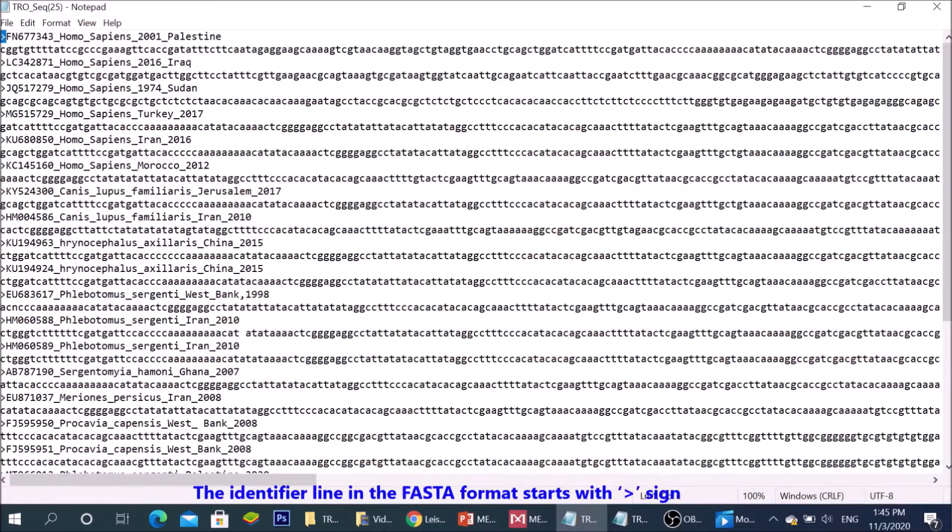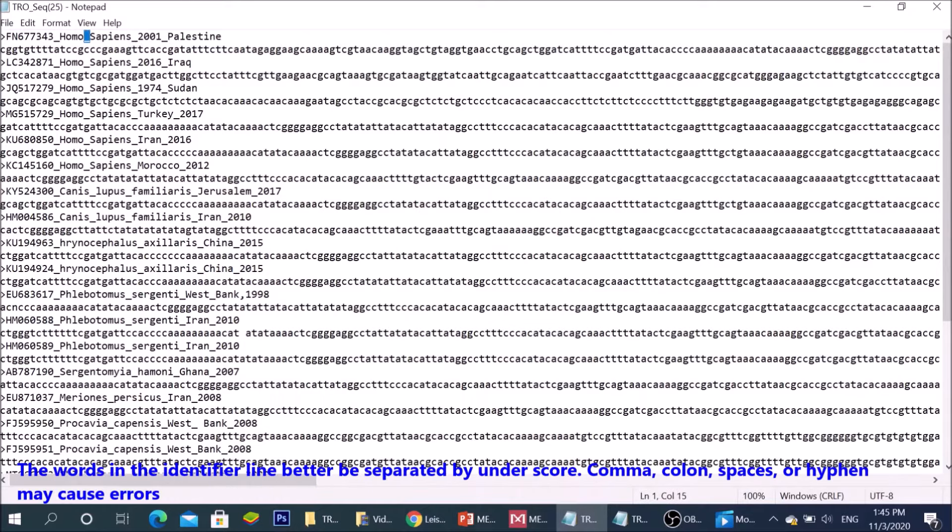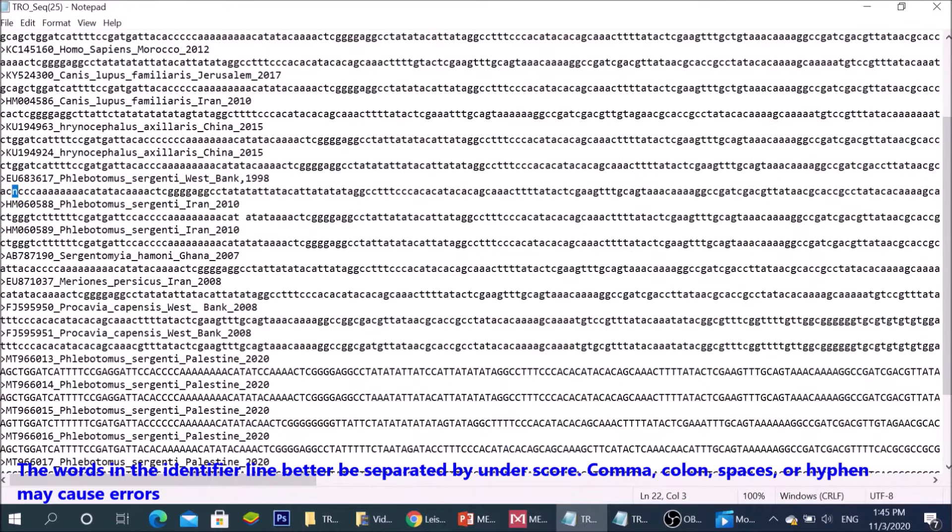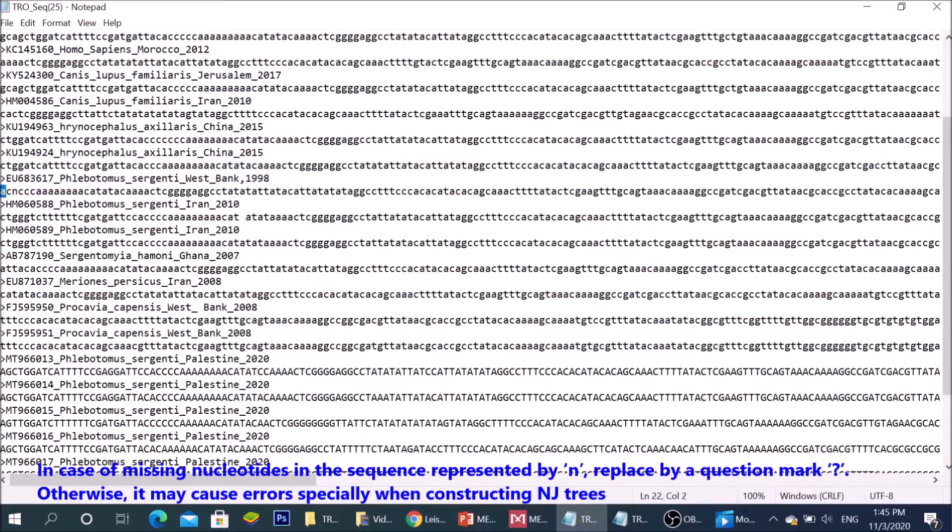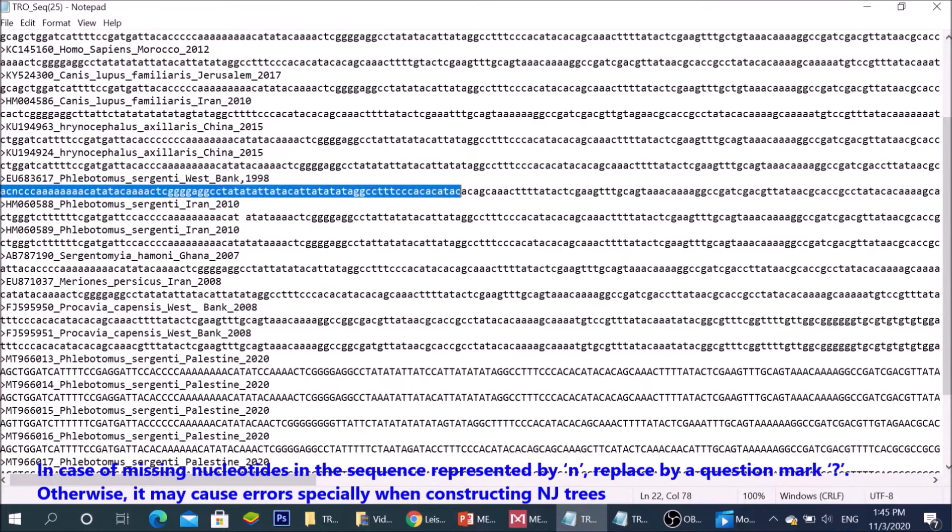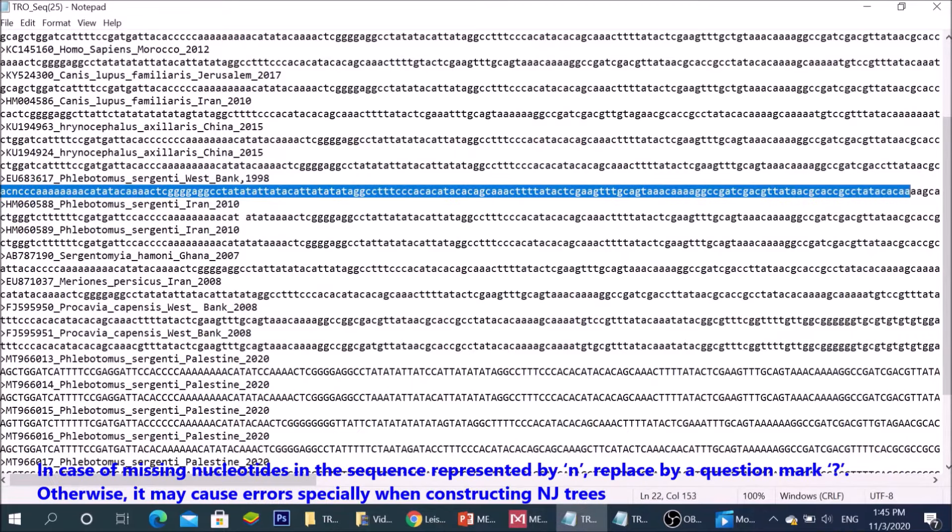The identifier line in the FASTA format starts with greater than sign. The words in the identifier line better be separated by underscore. Comma, colon, spaces, or hyphen may cause errors.